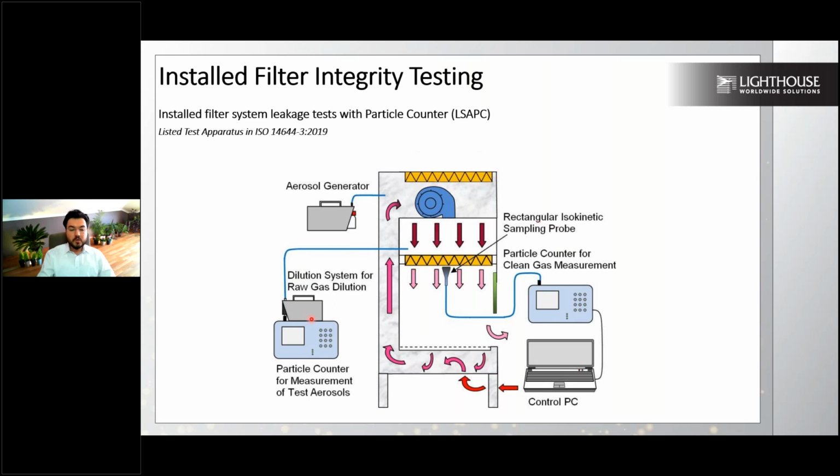Dilution system, when you are using, let's say, a 1 to 100 dilution system, 99% of all particles are captured with this diluter, while you are just counting 1%, and your computerized system should multiply this number by 100 in order to define the upstream challenge. This is one layer of information that you need to provide.